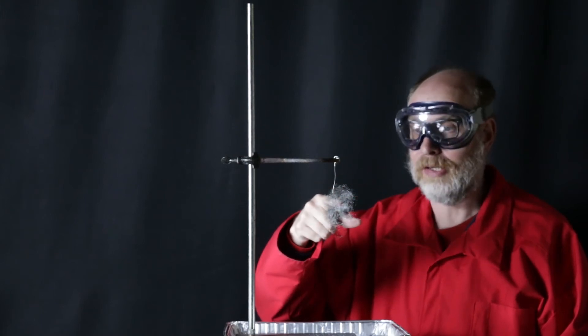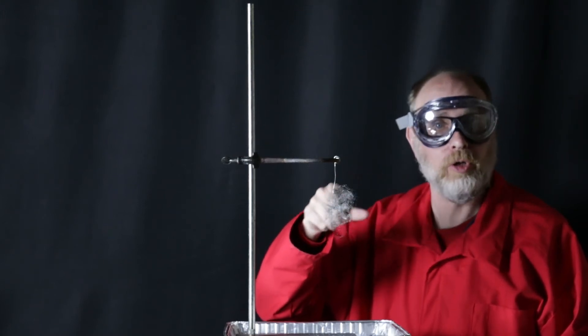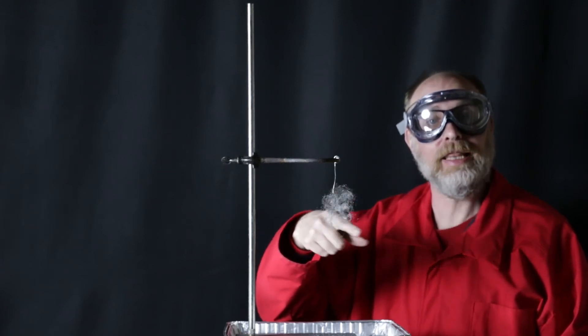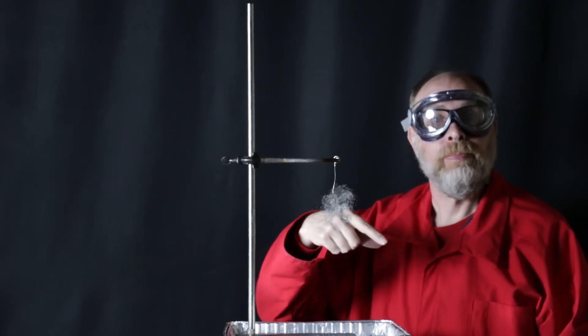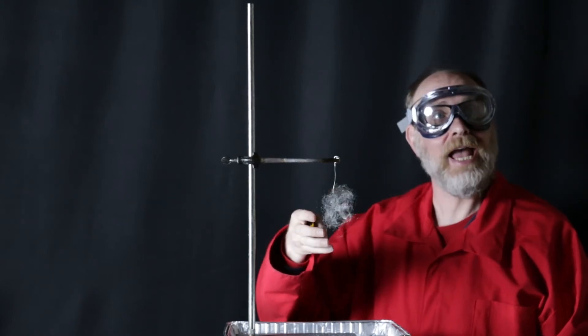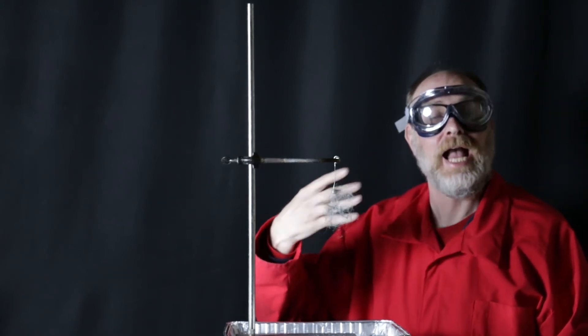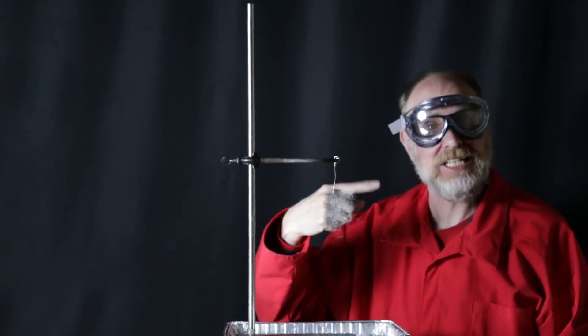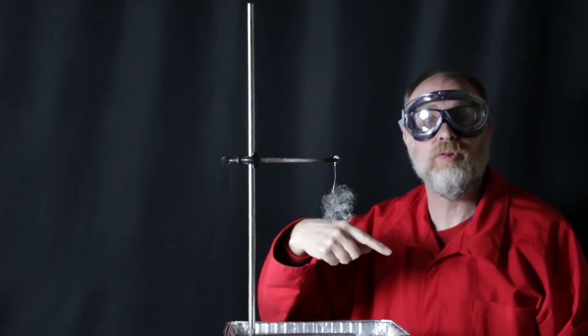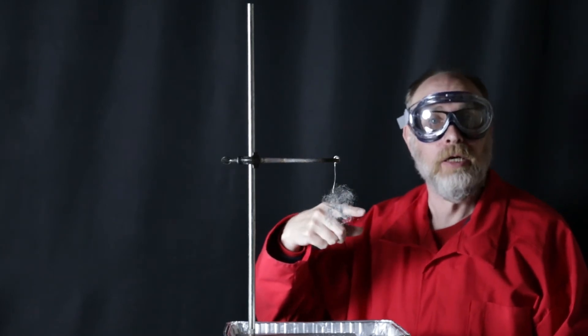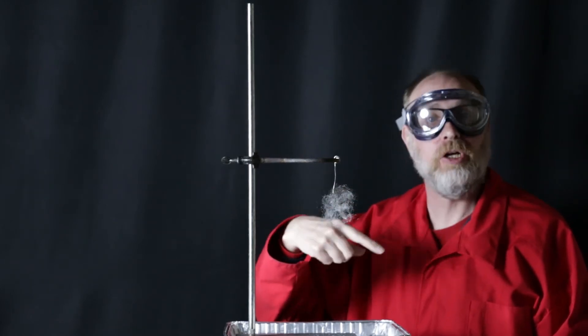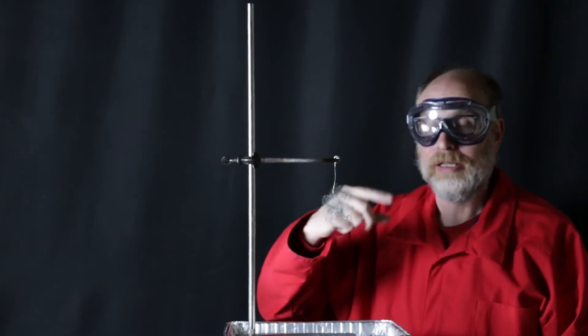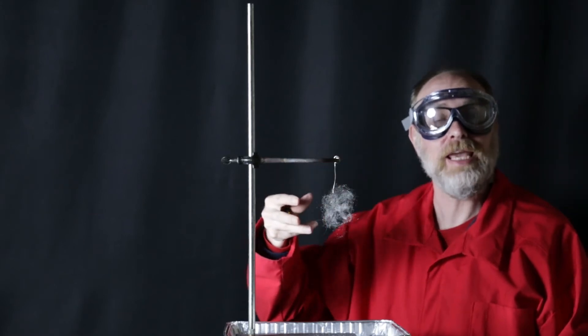Once that happens, the reaction will start to occur because the temperature is so high. So we're going to start to oxidize the iron in that wire. Now, the funny thing is, we're going to add energy to this reaction to get it to start going, that activation energy that we're going to provide. And then the reaction itself is going to produce energy because it's what we're going to call an exothermic reaction.